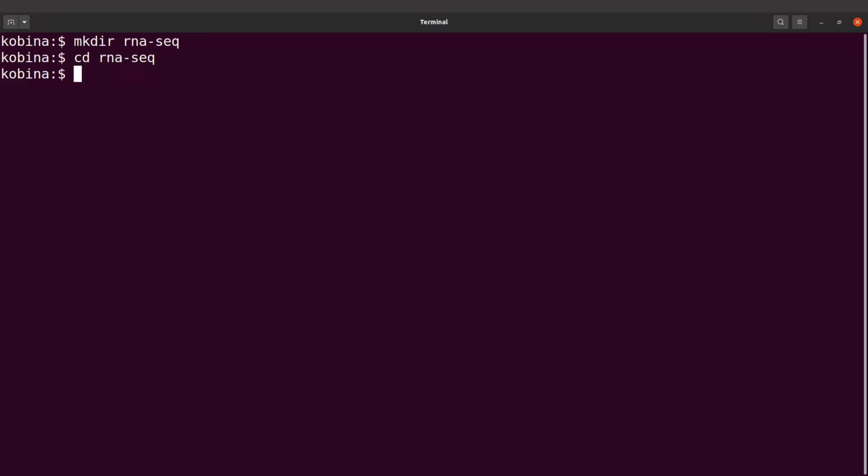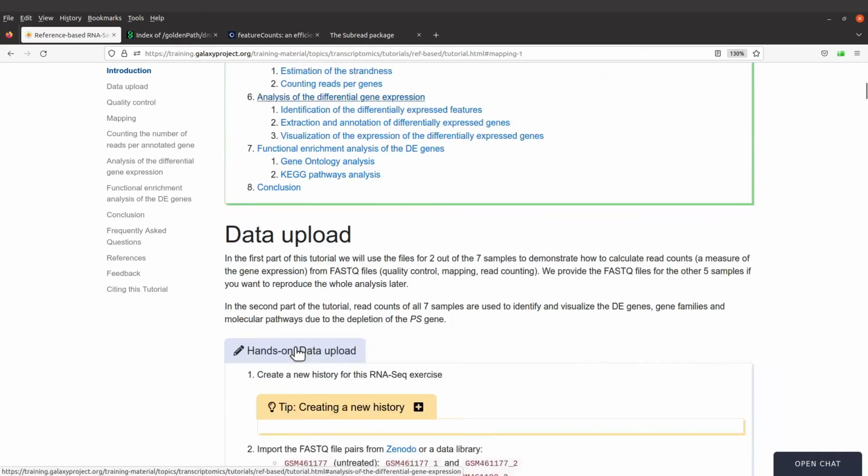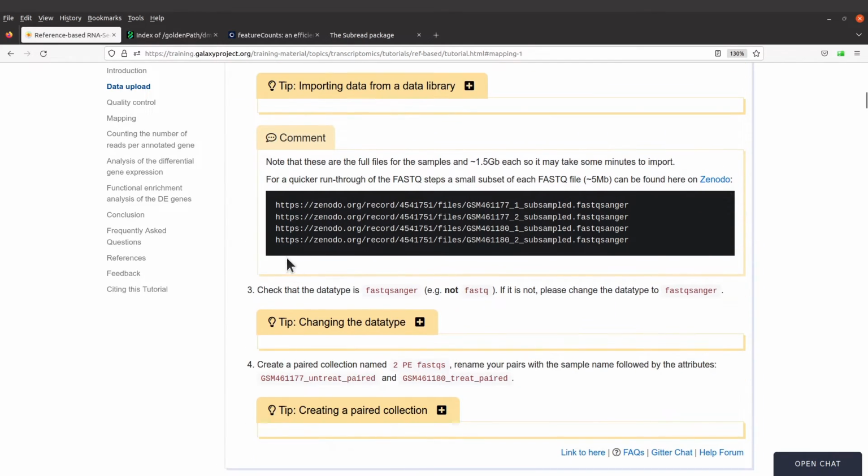So what we are going to do next is to download the necessary files. So first of all, let's go back. We need to organize our links. So let's go back to the various web pages or the various places where we can get the download links. Okay, so we will start with the Galaxy page where we have the files we will need.